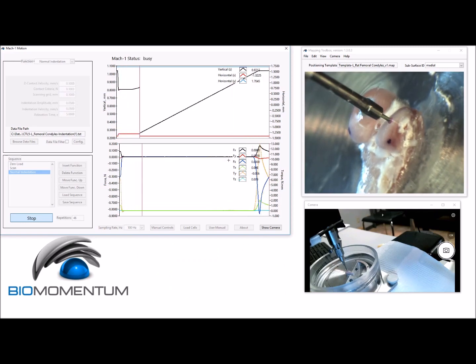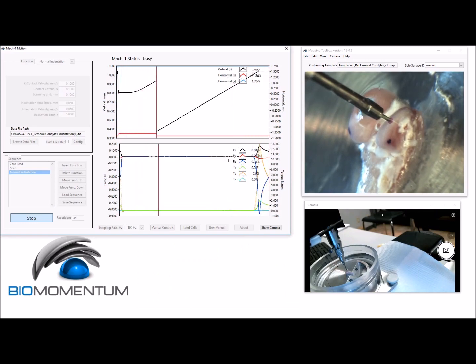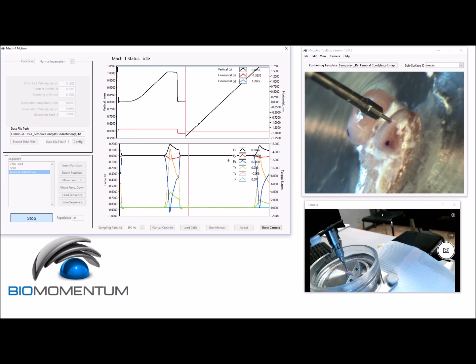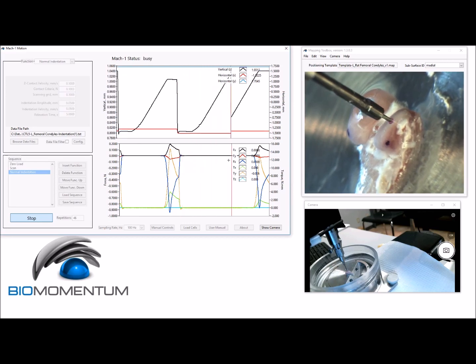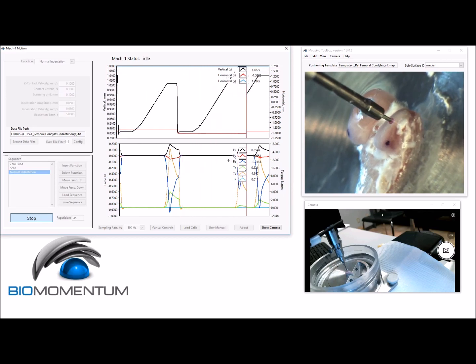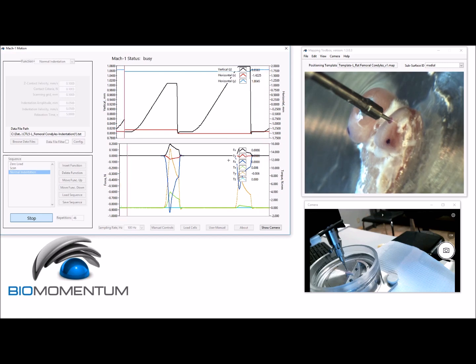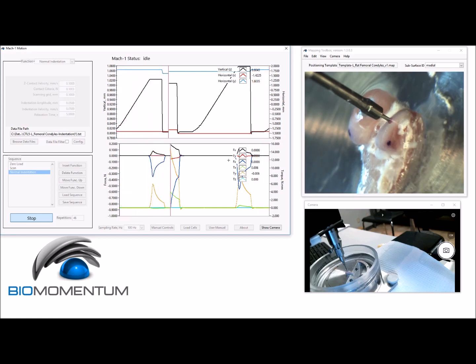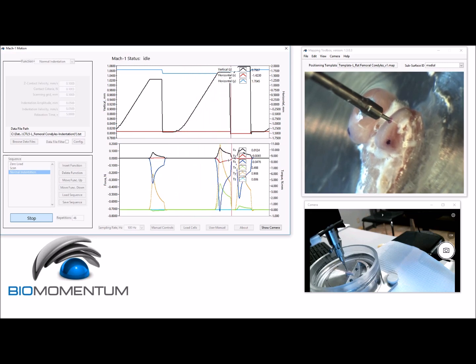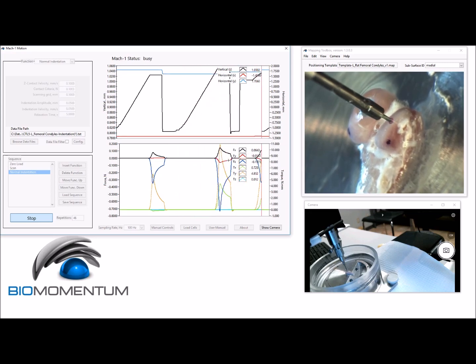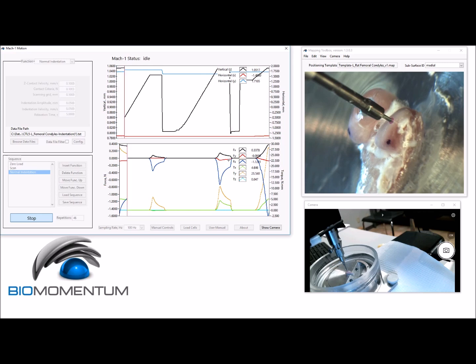The automated indentation first measures the contact coordinates of the predefined position and the contact coordinates of the four surrounding positions. The surface orientation is then calculated using the measured coordinates. Finally, a perpendicular indentation is performed at the predefined position.